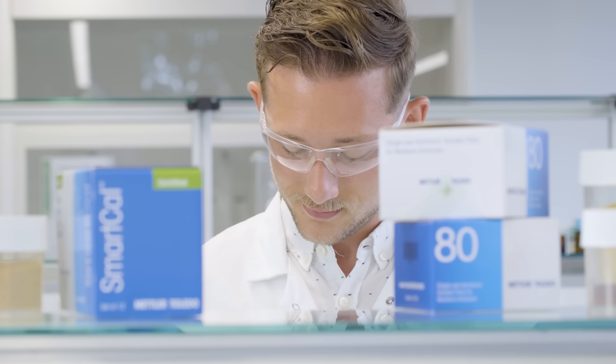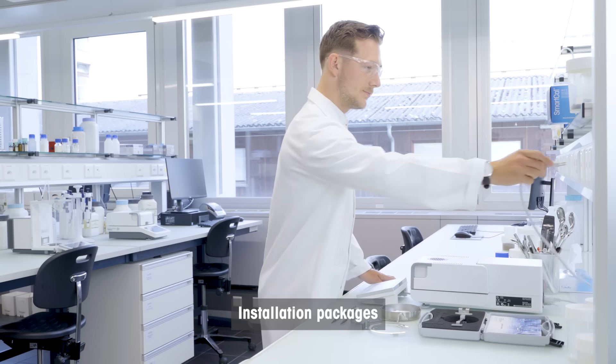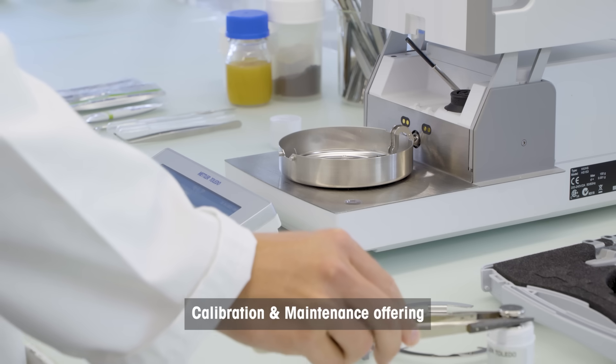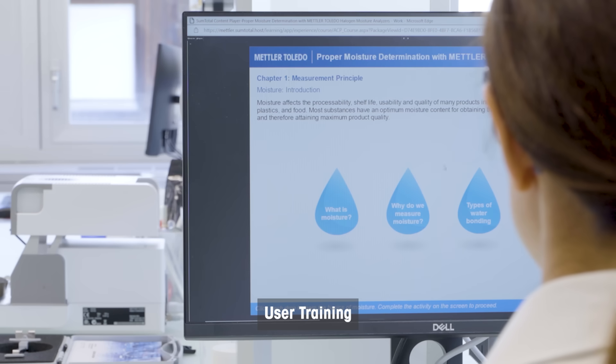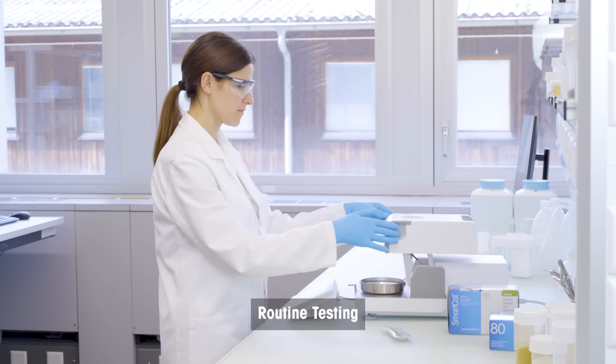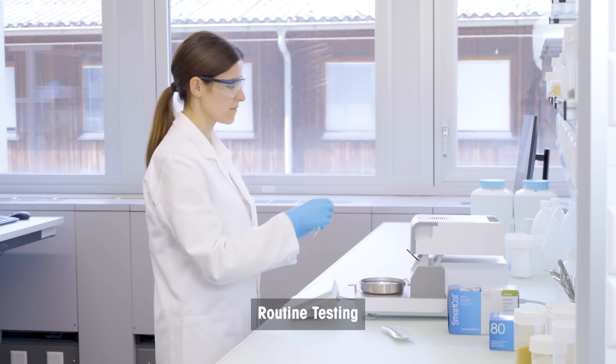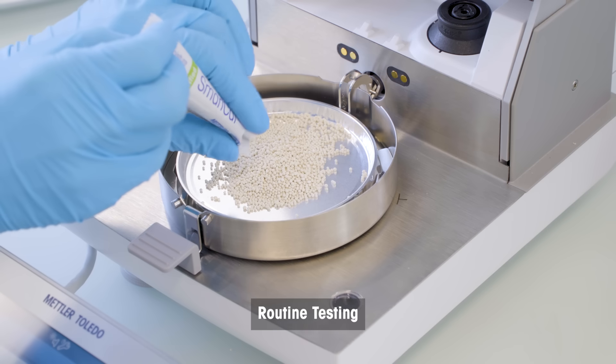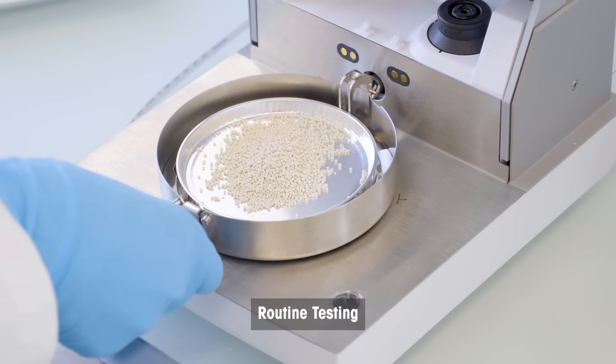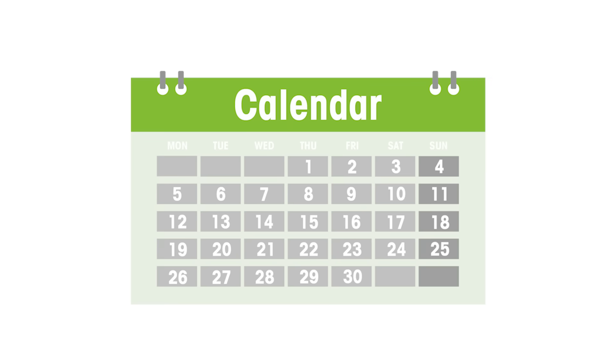In addition, based on your process risks, GMAP recommends the right installation package, calibration services, user training and frequency of routine testing to control the overall performance of your moisture analyzer. Please note that calibration and routine testing frequencies are based on risk. That means if your risk is high, more activities are recommended. If your risk is low, then you can save effort by doing them less frequently.